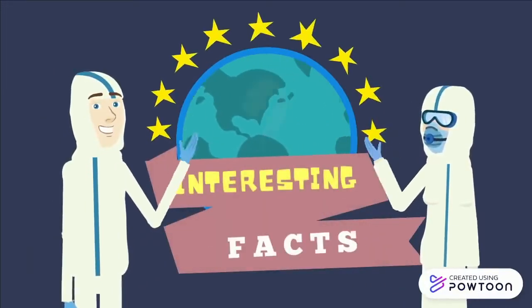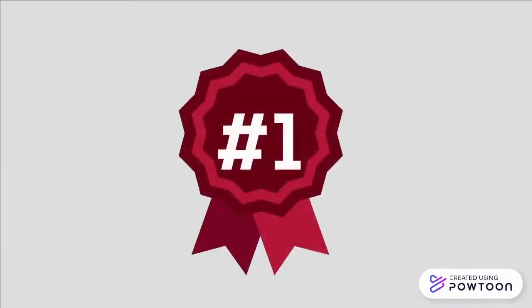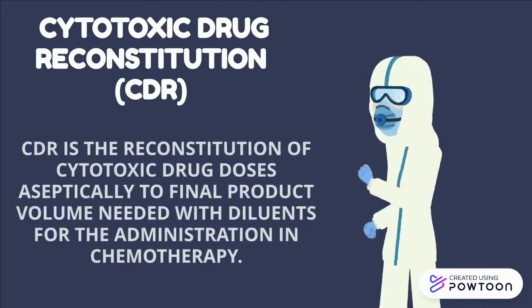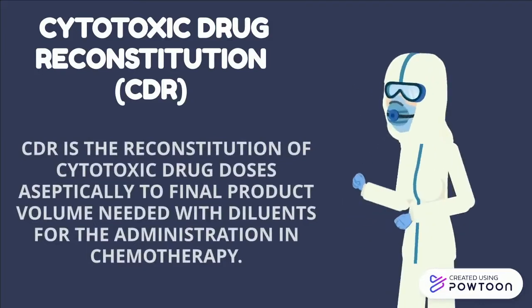Interesting facts. Cytotoxic drug reconstitution (CDR). CDR is the reconstitution of cytotoxic drug doses aseptically to the final product volume needed with diluents for the administration in chemotherapy.